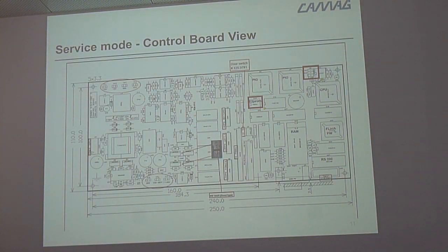If you change it, for instance, with a scanner, and you take the EEPROM from another instrument, so if you have two instruments and you would like to check, you take the one from the other one, it is working fine. It is displaying you the serial number of the other instrument, but the settings are not the same. Therefore, you will fail on all the tests. So you have to take out the EEPROM from the old one and put it in to meet all the tests, because the settings will be completely different.